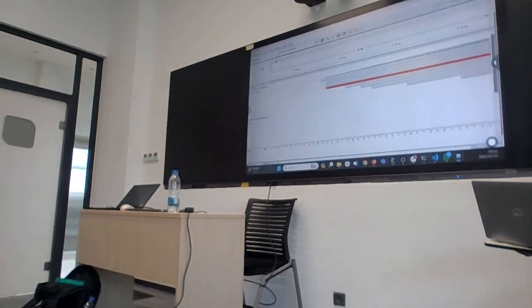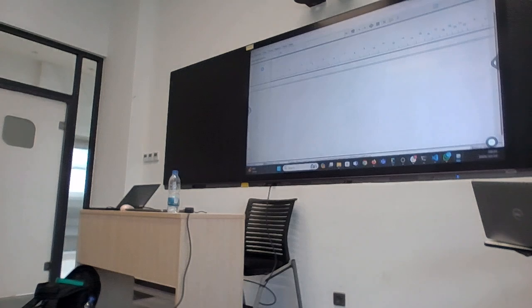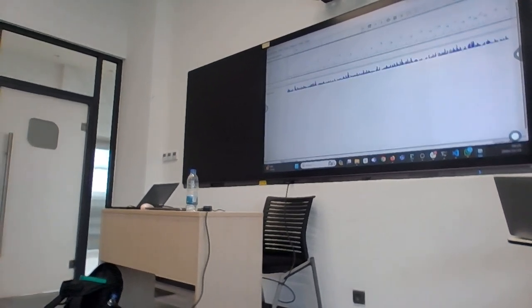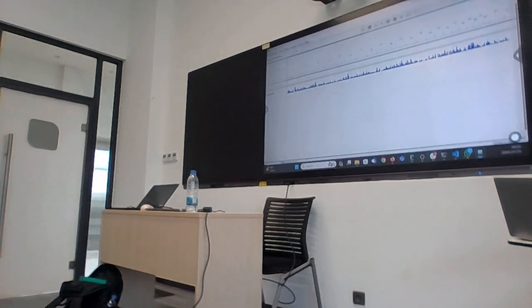When you start up IGV for the first time, it will not say MT903345 there on the left. Yours says human. Other people, what does your IGV say in the left-hand drop-down? What does it say? Human, right?